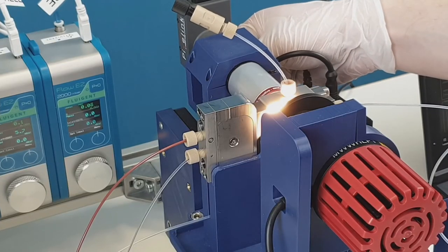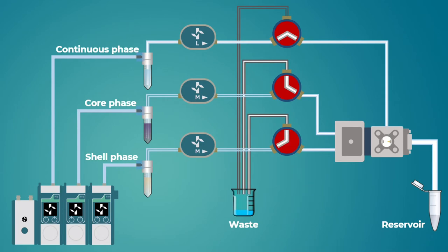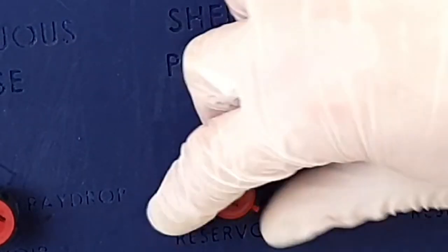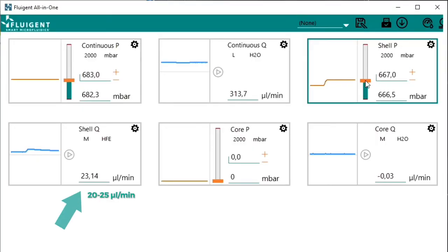We will first start by producing a single emulsion of the shell phase — in our case the oil — in the continuous phase. The core phase remains closed and the shell phase is turned to the waste in order to wet the tubing from the reservoir to the valve. Air and bubbles are pushed to the waste. Set the pressure of the continuous phase to enable a flow rate of 300 to 350 microliters per minute. This is the optimal value for the double emulsion ray drop. Turn on the valve of the oil to the ray drop position and increase the pressure until a flow rate of 20 to 25 microliters per minute is established.